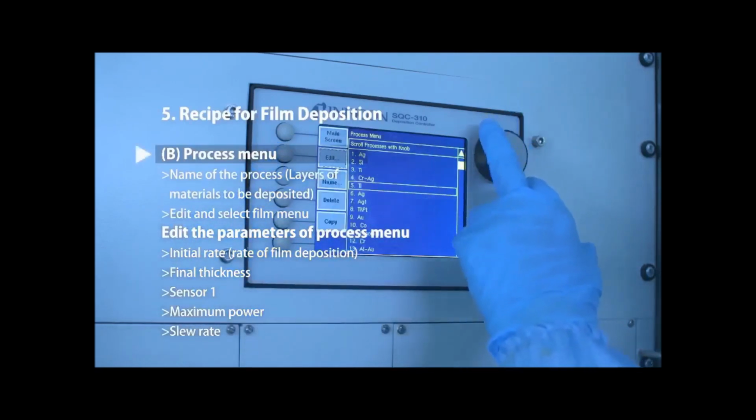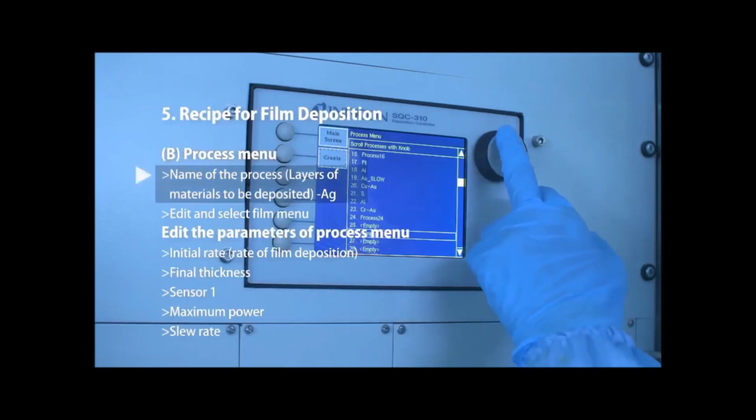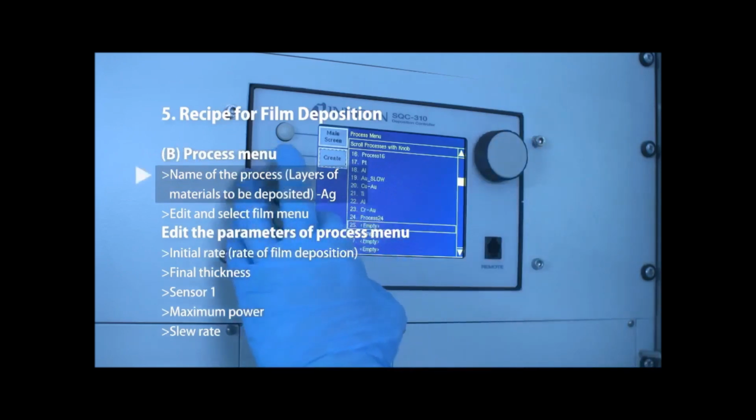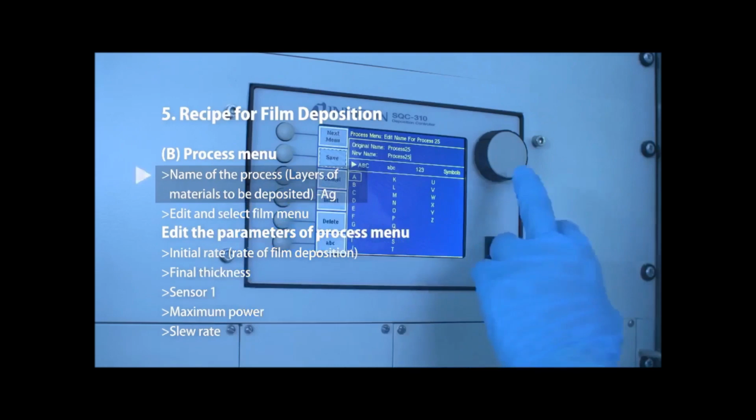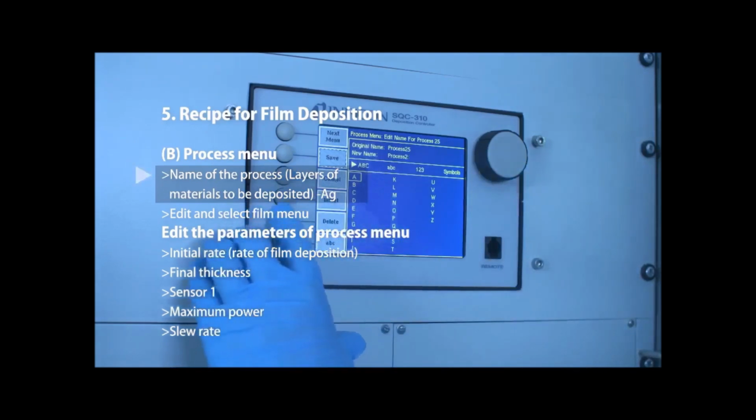In the process menu, similar to the film menu, we have to set the name of the process that we want to deposit. Here we have to create, edit name. We are going to deposit a single layer, so we can put the name silver here also, AG.